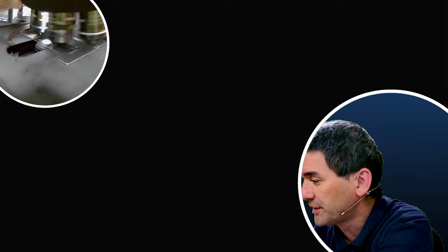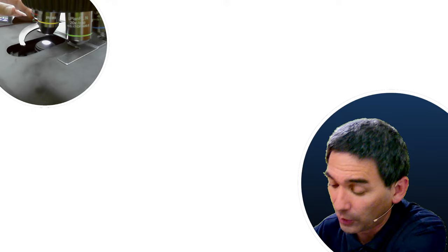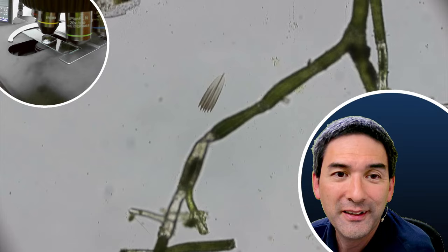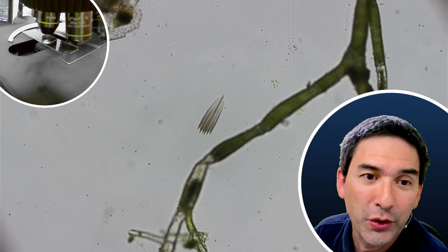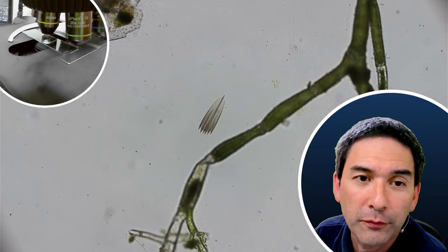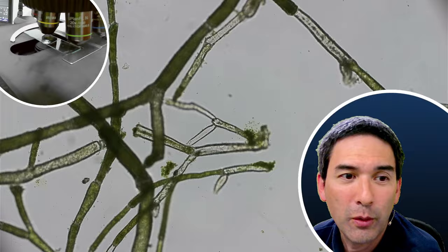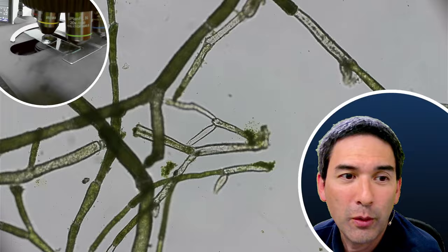Now I want to show a water sample with some algae. Looking at it in phase contrast and DIC and dark field. In bright field - wow, right in the center that's the scale of a butterfly or moth, I don't know how it found its way into the water sample. This is a water sample with algae. I'm going to go down with the magnification a little bit.